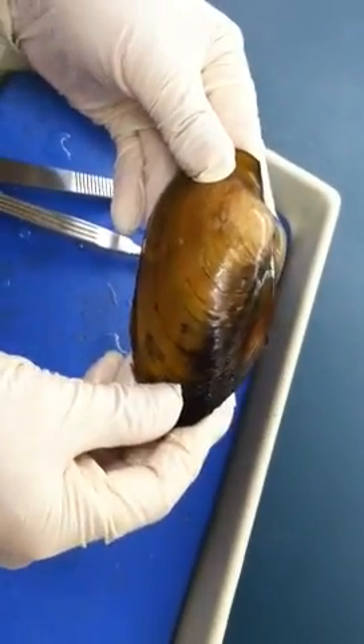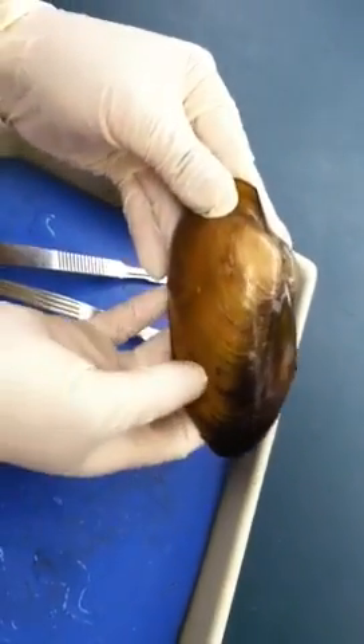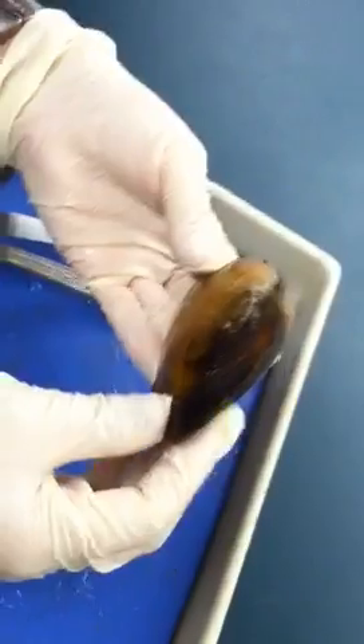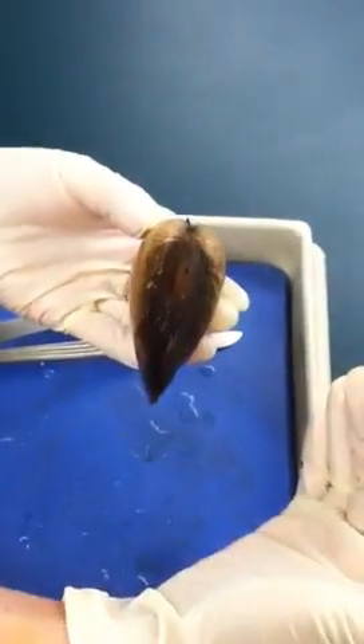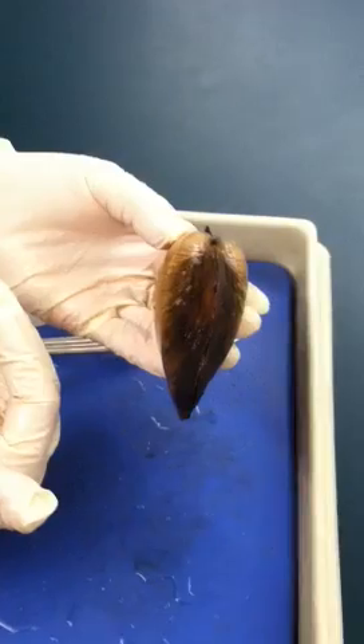And then we need to tell which one is the left valve and which one is the right valve. What you do is face posterior toward yourself, and then the one on the right will be the right valve, and the one on the left will be the left valve.